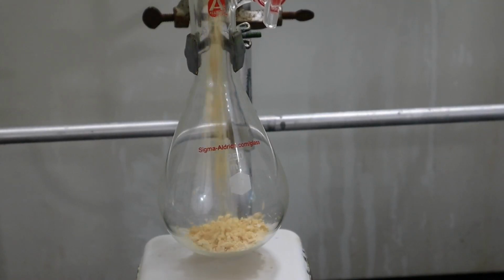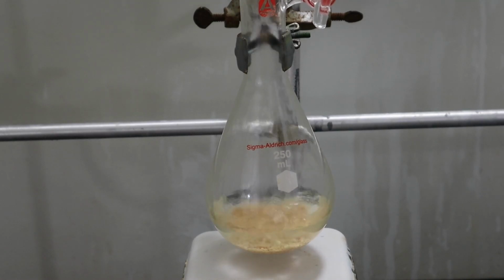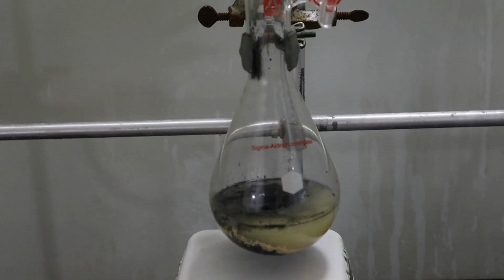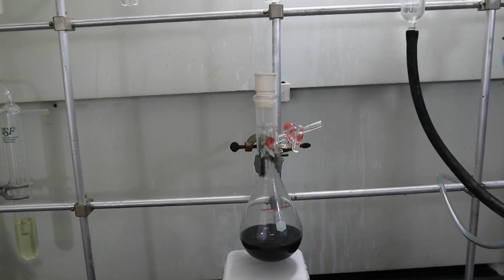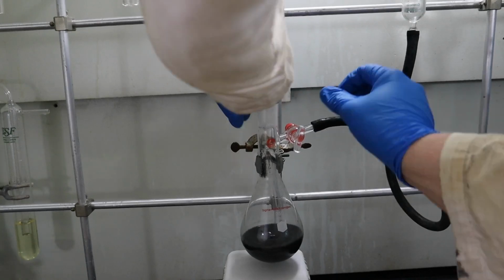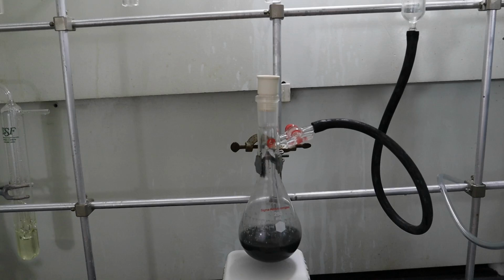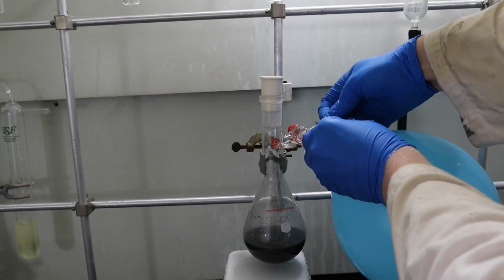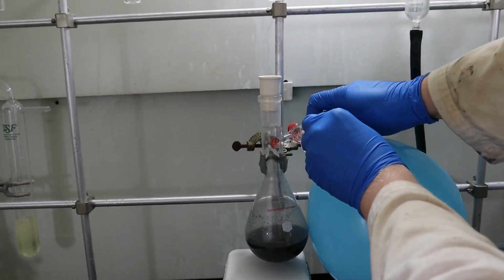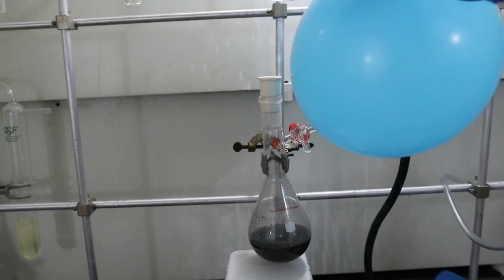I added 6 grams of the imine to a Schlenk flask and dissolved it in 100 milliliters of methanol. I then added 0.75 grams of palladium on carbon and sealed the flask. I used the Schlenk line to replace the atmosphere with nitrogen and then evacuate the flask. It was really important to remove all the oxygen from the flask because hydrogen is extremely flammable, and palladium on carbon, when saturated with hydrogen, can spontaneously combust. I attached a balloon containing hydrogen to the evacuated flask. Opening the stopcock filled the flask with hydrogen. I left it to stir overnight.